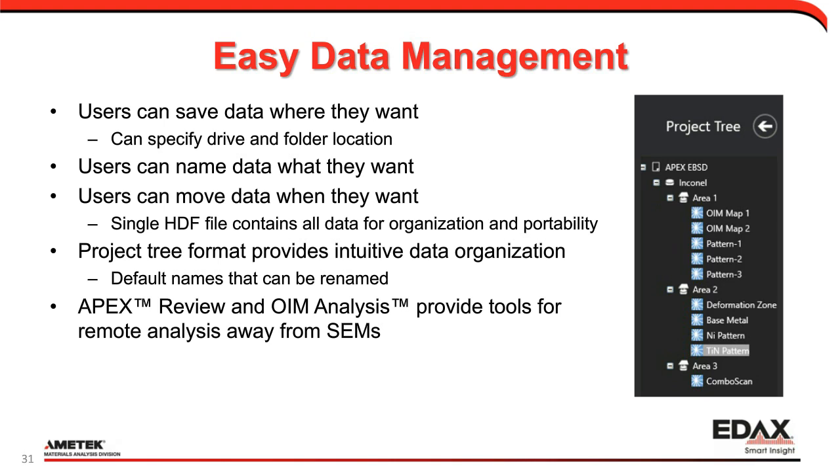And then these can be used with the review tools that are accessible for analysis away from the SEM, which means you don't have to use up valuable SEM computer time. You can go to a remote workstation to do that. And our software is designed for that remote work away from the microscope collection.